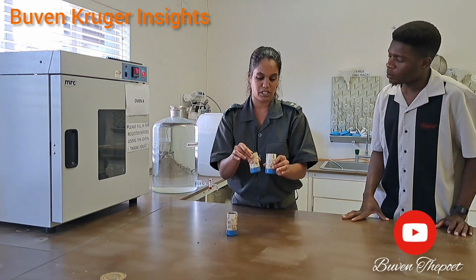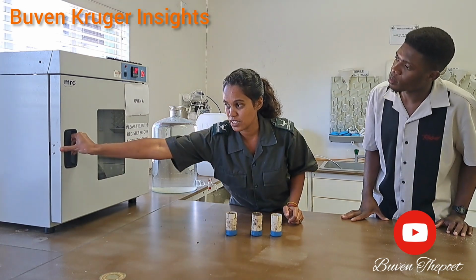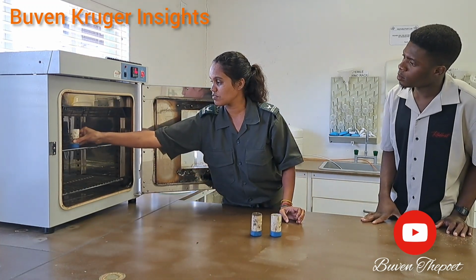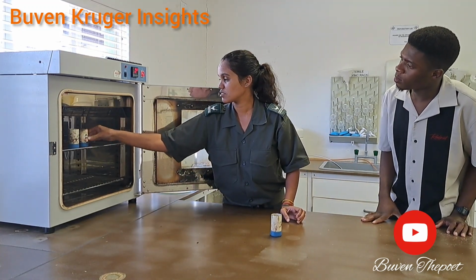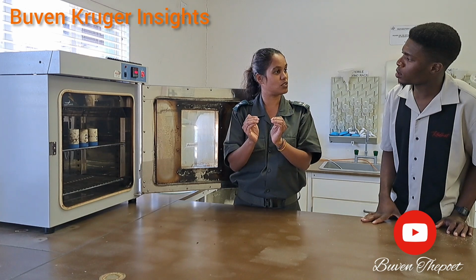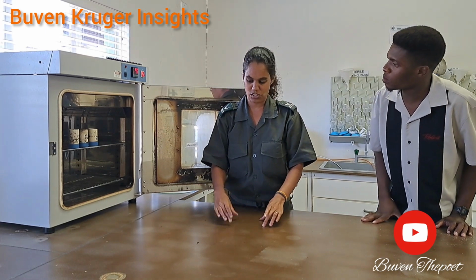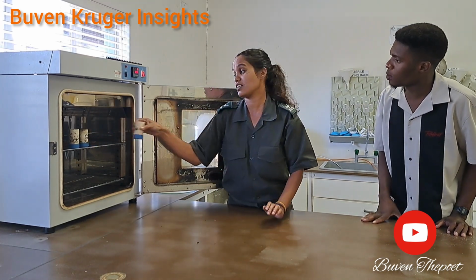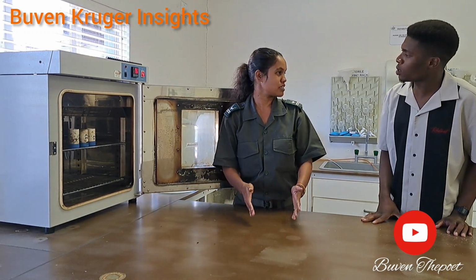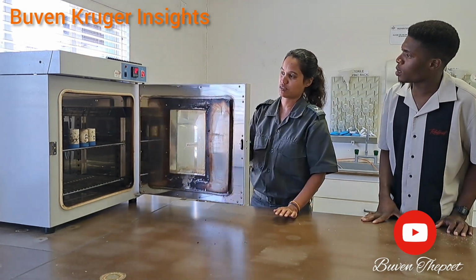Once I get the wet weight of these samples, with the water still between the soil particles, I put them in the oven at 105 degrees for 24 hours. Within that time the water evaporates, so by the time I weigh it again, it will be without the water. That missing value in the equation is how we calculate moisture content. With each site that we measure, we never just take one sample. We always take more than one because you can get a range of values, and with maths you need to get the average, or the mean, so we always have multiple samples.